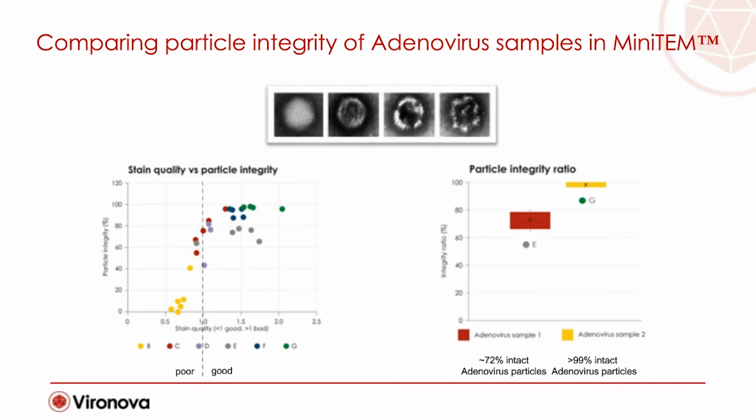For the adenoviral samples, the preparations of samples B, C, and D are disqualified automatically, but the samples E, F, and G show a comparably different integrity as well as internally low variability. The reason for the adenoviral integrity variation between samples can, for example, be linked to stresses on the surface proteins, such as the pentons, caused by filtration or buffer composition.